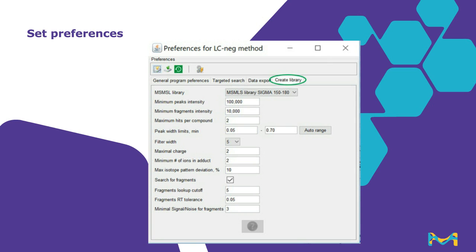Okay, so once you've selected the correct library, this screen may be used to modify the other program parameters. And you'll see it already has numbers filled in, and these default settings are a good place to start, and then you can tune them as needed. I'm sure many of you are already familiar with many of these settings. I'll give you an overview of these parameters, and these are also fully defined in the user guide.